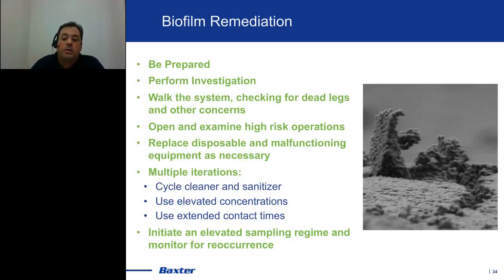All right, so going on to biofilm remediation. Basically, my suggestion, as I've talked before, is be prepared. Really have a backup plan in place. Do a good investigation. Walk through your systems, open it up if you need to, take a look inside, look at your high risk areas. When possible, replace disposable components. Definitely replace anything that's malfunctioning or has issues.